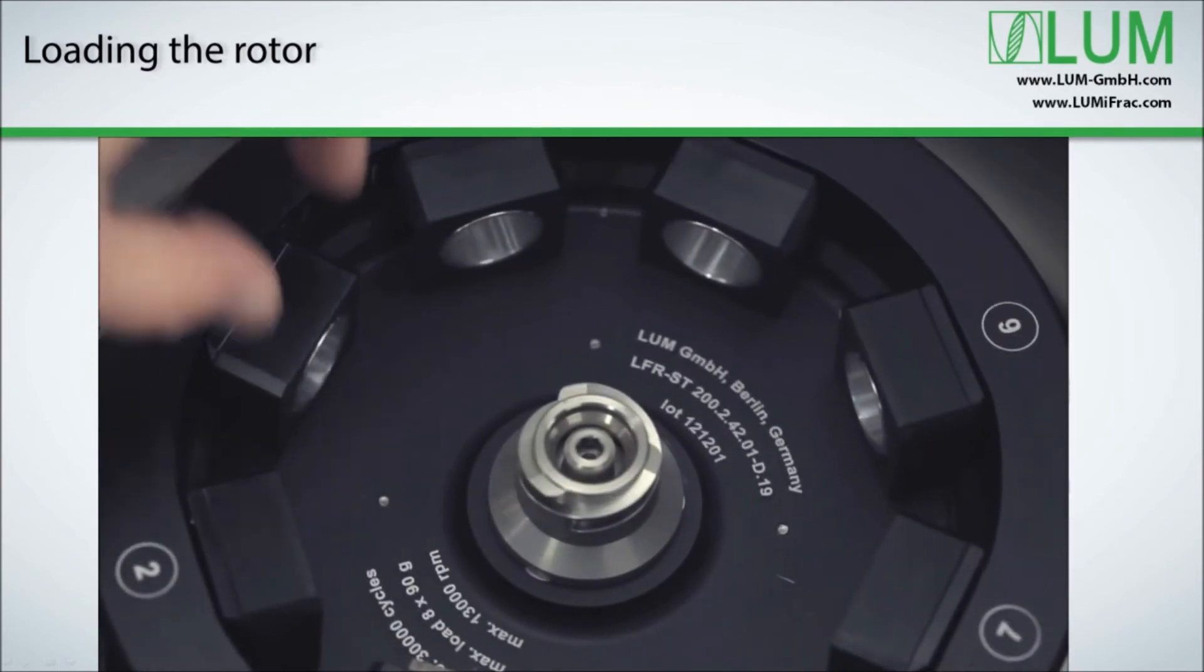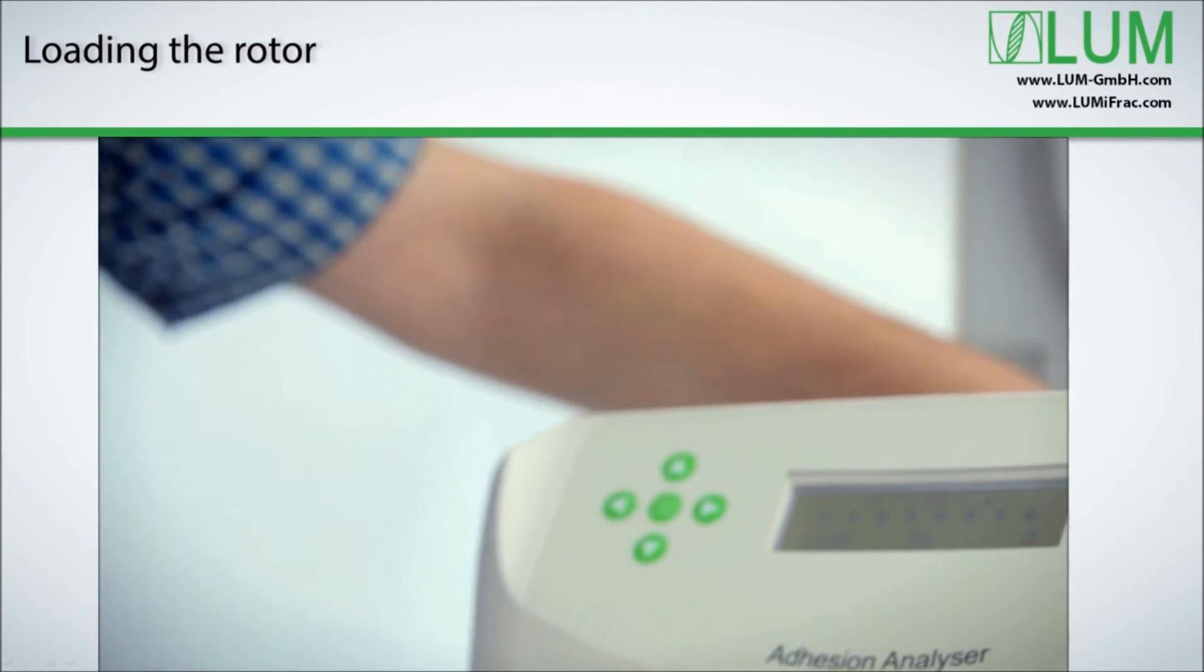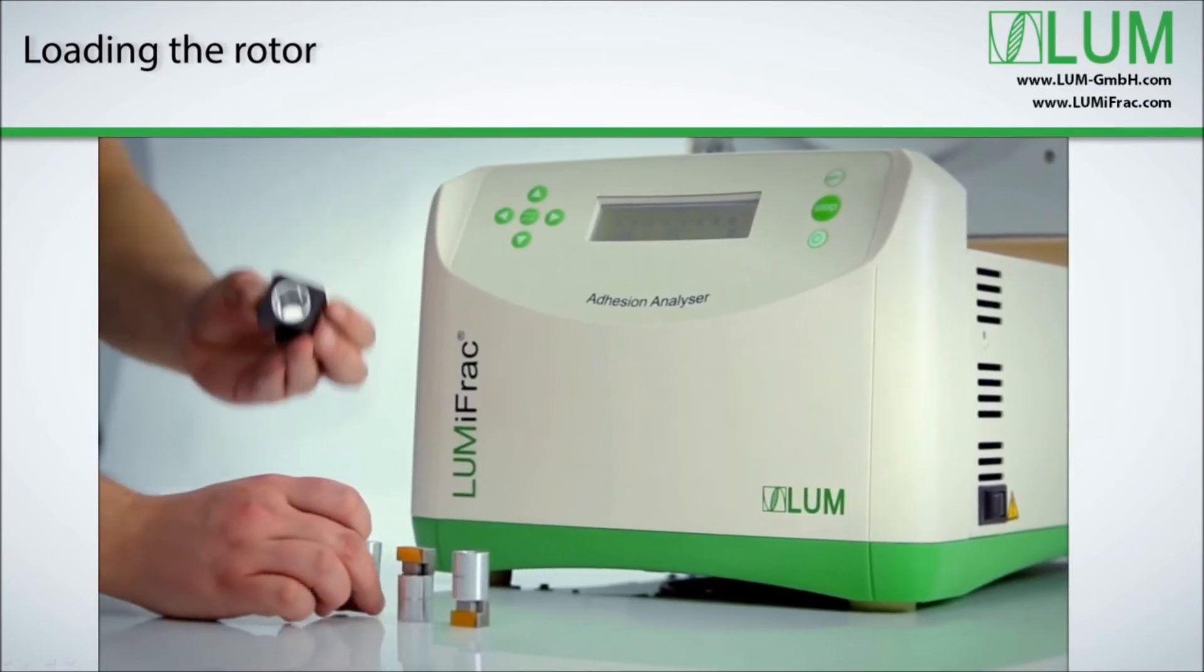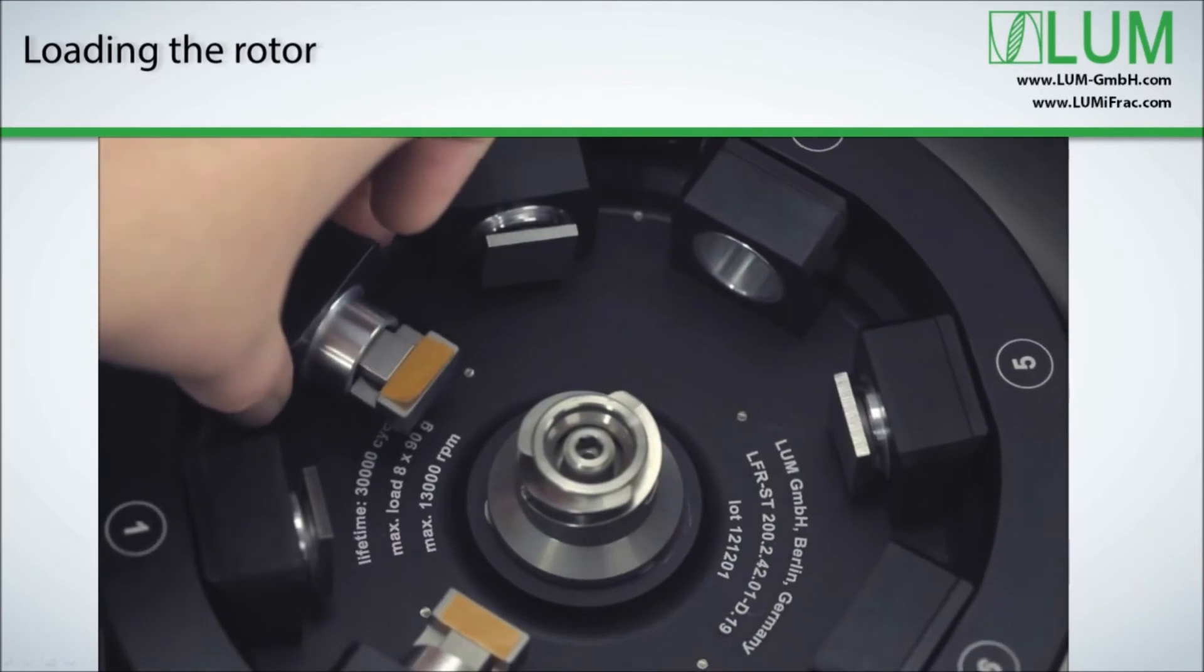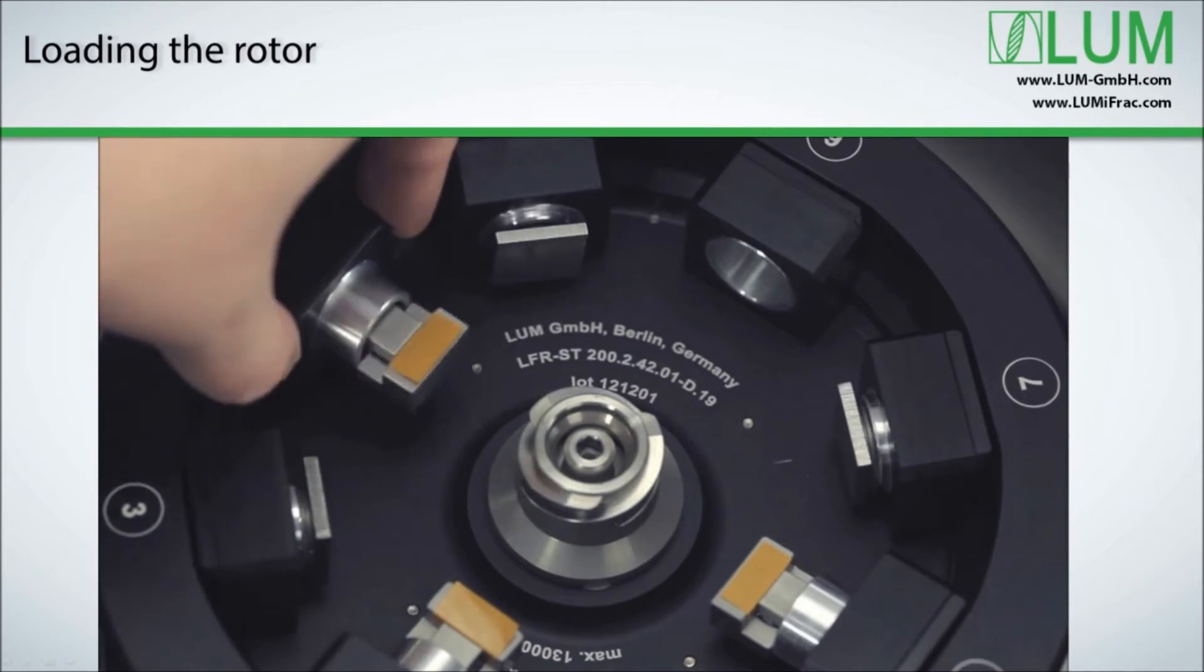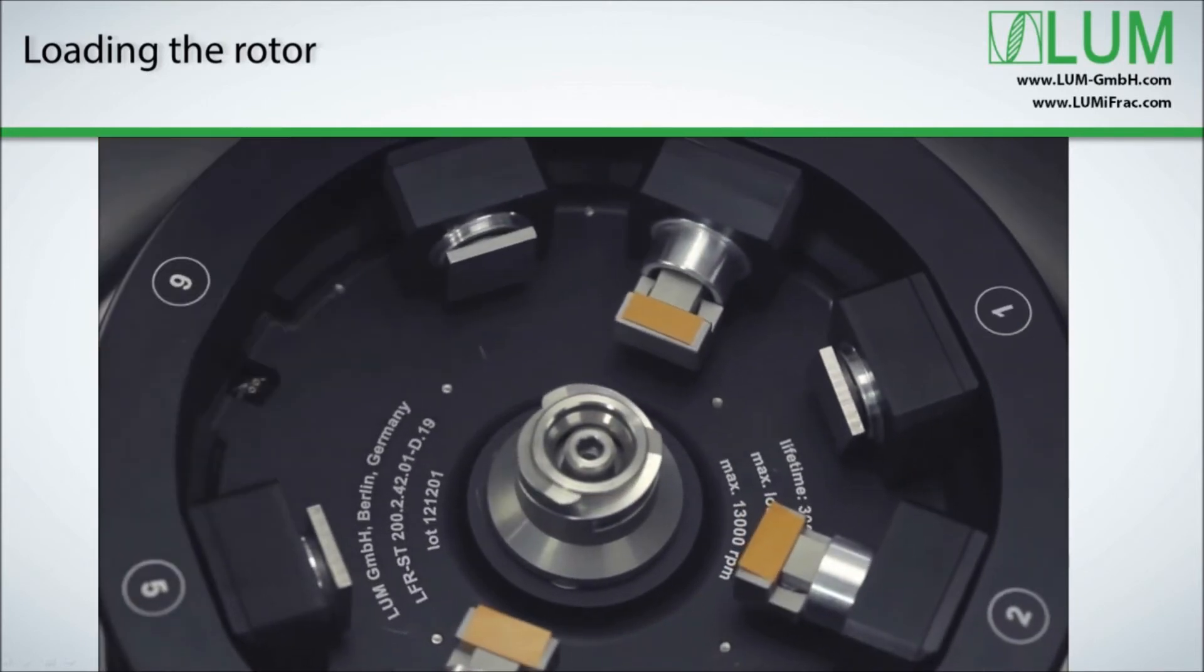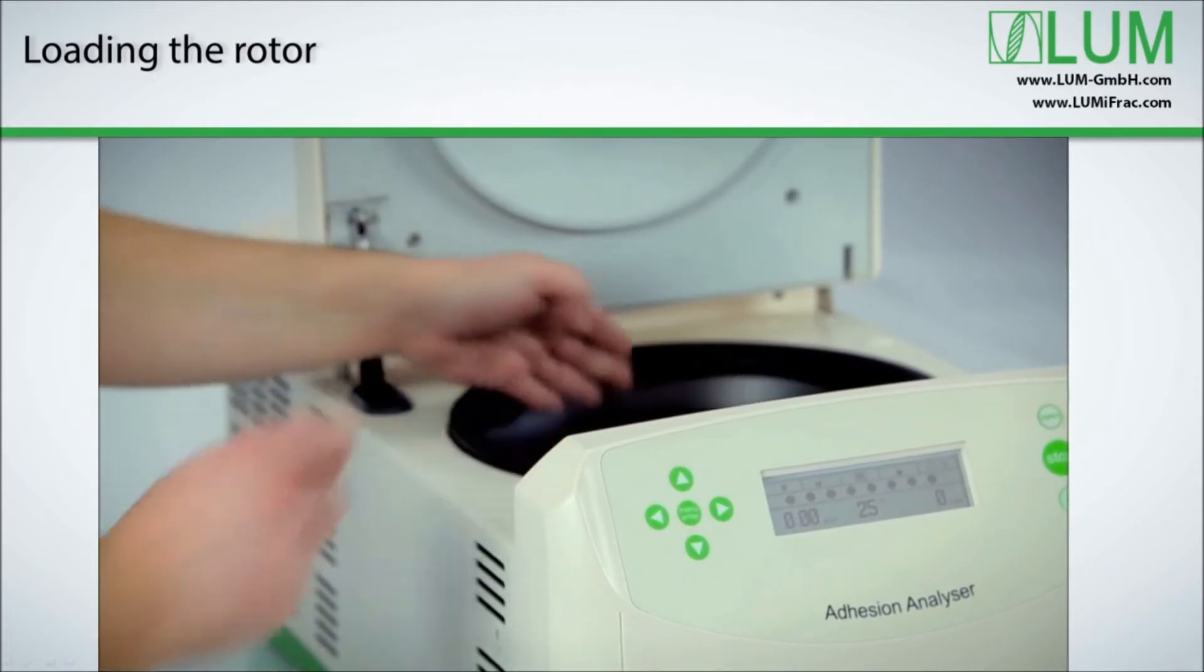We now take them out and begin to join every specimen into one module. The modules are then loaded into the rotor one by one. In this instance, you see we fully load the rotor, but of course you can test any equal quantity like 2, 4 or 6. You can test tensile and shear specimen together in one run. When the chosen number of modules is equipped, we close rotor and centrifuge lid.